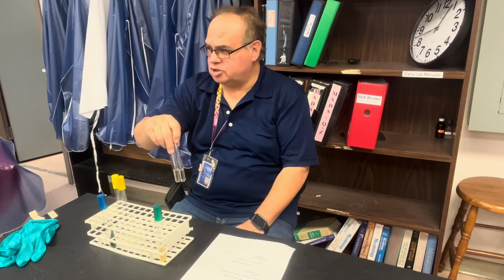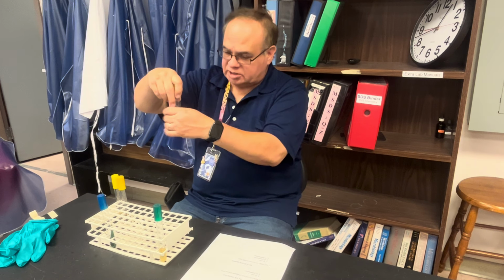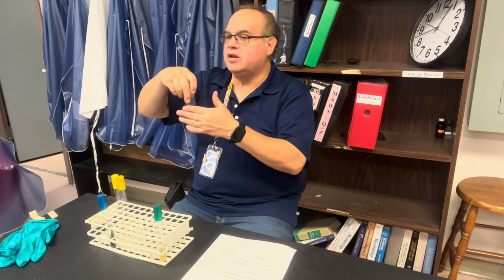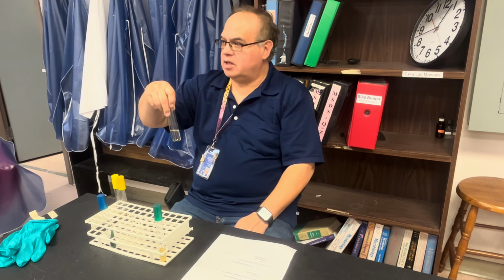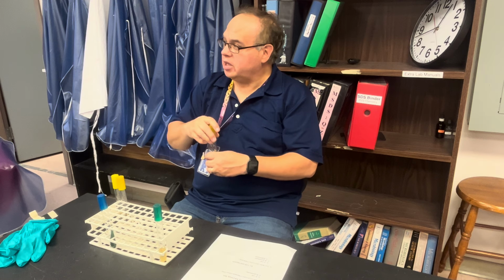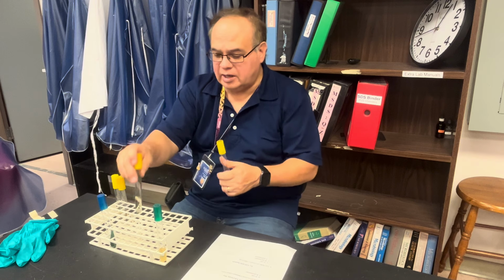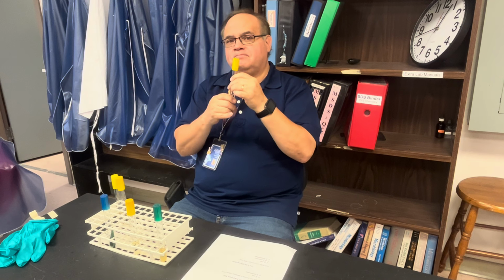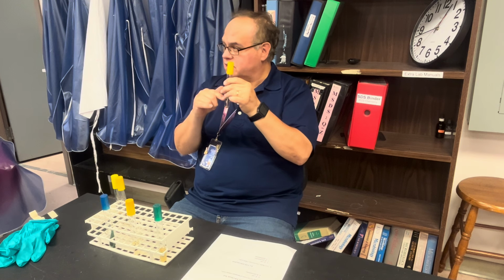The glucose is the principal substrate. You're going to inoculate this with one set, one MR, one VP for E. coli, and then another set, one MR, one VP for Enterobacter. You're going to come back in 2 days on Thursday, and to the one labeled MR, you're going to add 5 drops of methyl red, and if it turns red, then it's positive for acidic conditions.